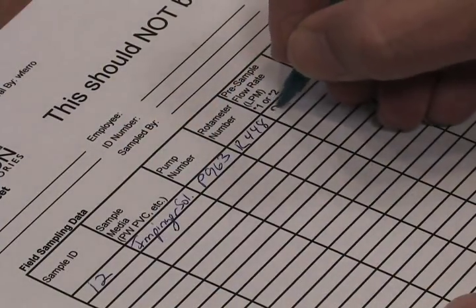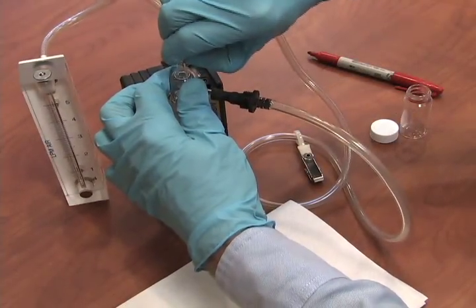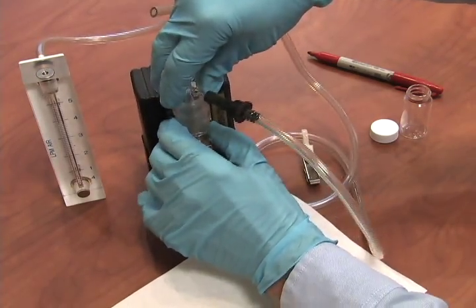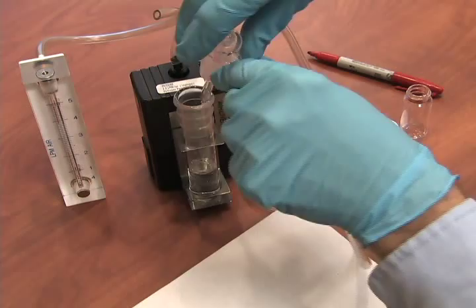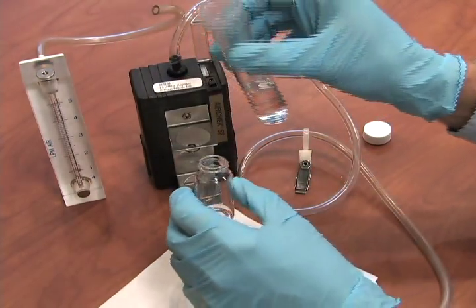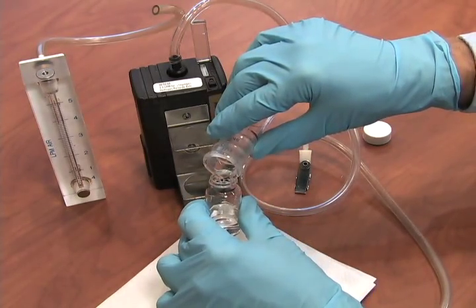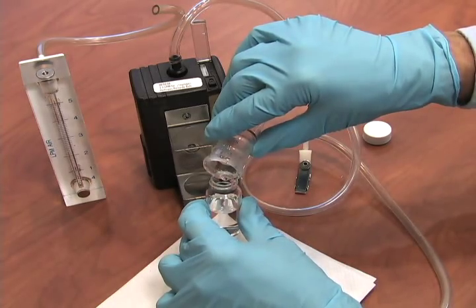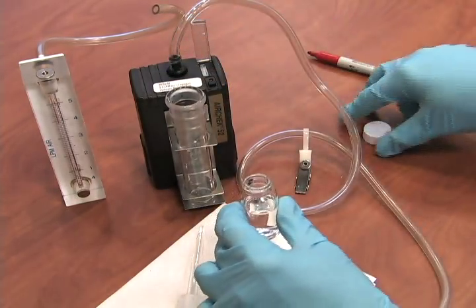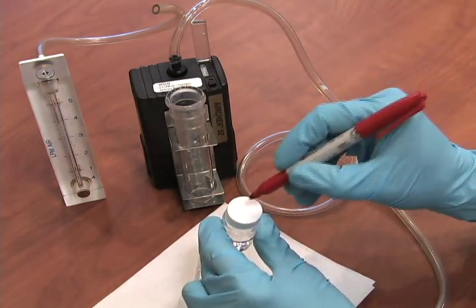After you are satisfied with the flow rate, turn off the pump and record the value on the field pump data sheet. Remove the rotometer from the impinger. Carefully transfer the solution to a vial.